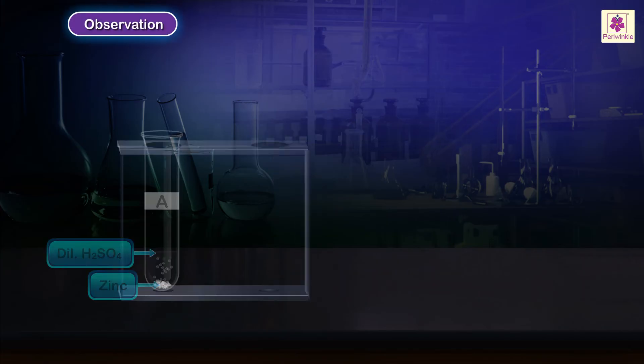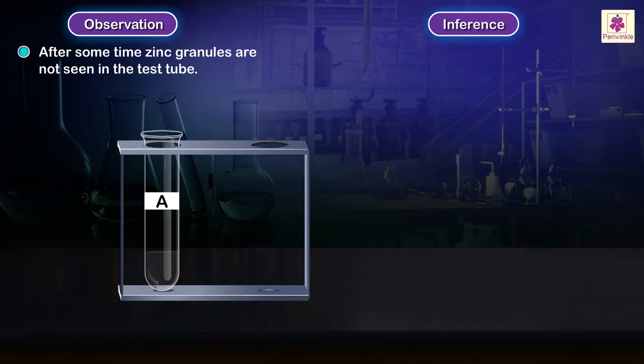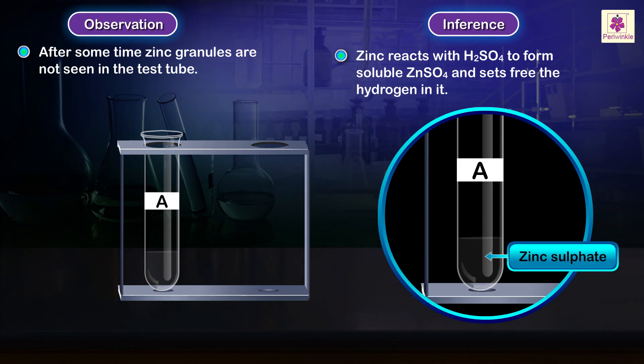Observation: After some time zinc granules are not seen in the test tube. Inference: Zinc reacts with sulfuric acid to form soluble zinc sulfate and sets free the hydrogen in it.